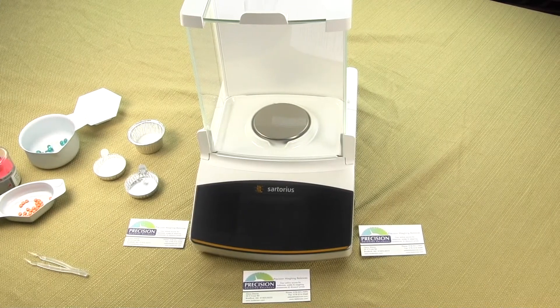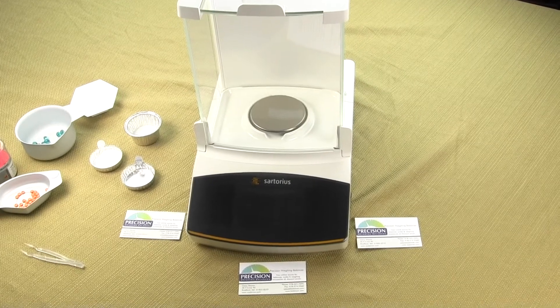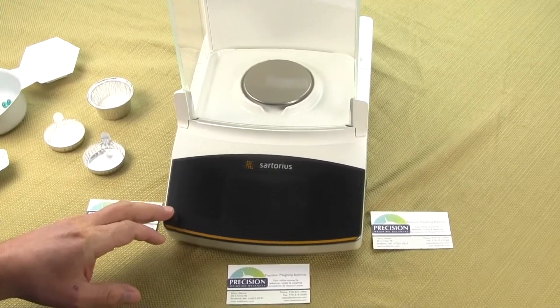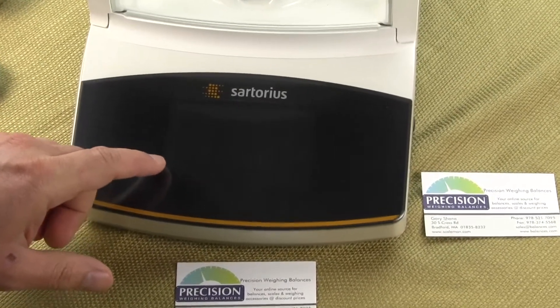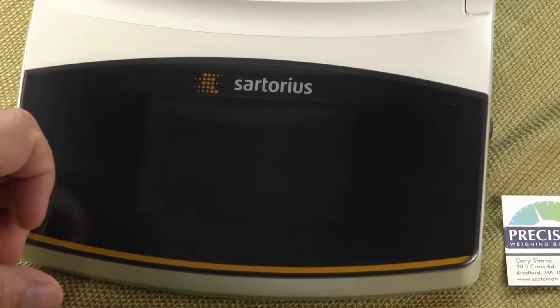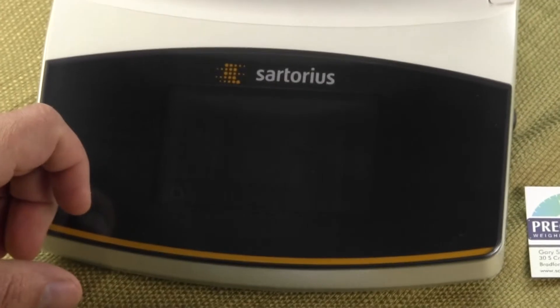In this video, we're going to cover the weigh-in mode and the different configuration choices you have for a Sartorius Practum, Quintix, or Secura laboratory balance. I'll be using a Secura 225D in this demonstration, and Wear Precision are an authorized distributor of Sartorius balances.